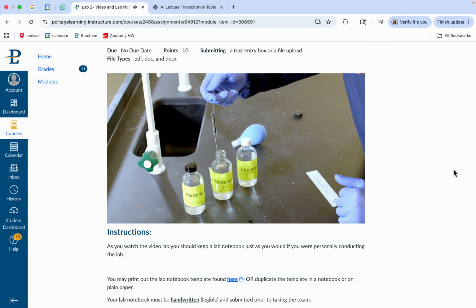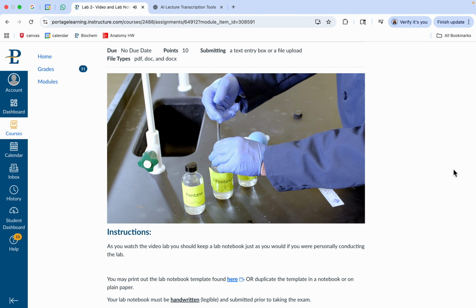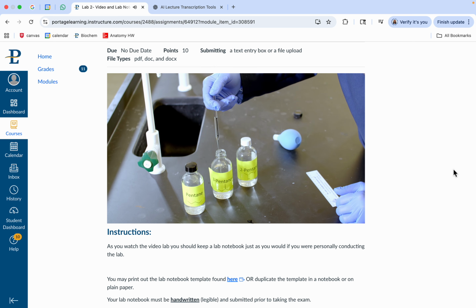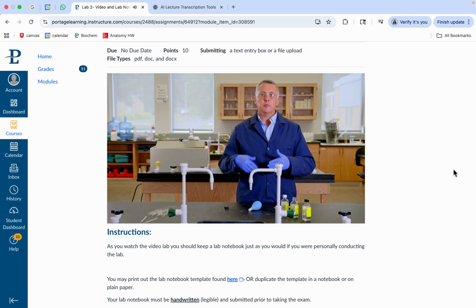So I'll get the second one. I've got it in position. So now I'm going to say start, stop. And I'm going to do it a third time. I've got it in position, so I'll say start, stop. All right, so pentanone, again, you can just notice that it was a little bit slower in this particular case compared to pentane.